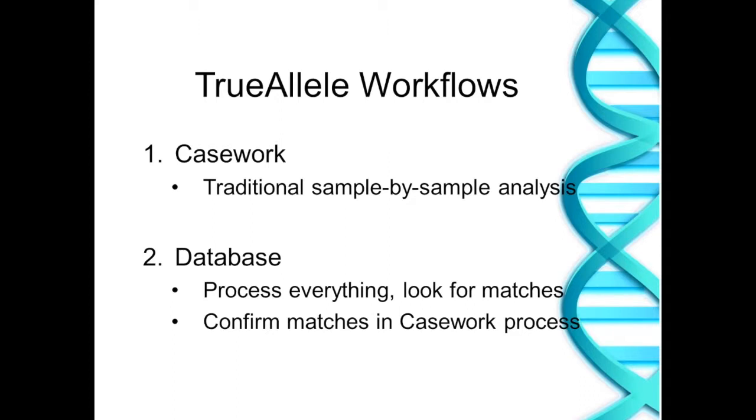The other workflow is the database workflow, in which you batch upload the entire run file, or the entire run folder, excuse me, to an individual database world. You look for matches, and then you go back and take any matching samples to the casework process for confirmation. In our lab, we decided to go ahead and implement the database workflow for 2 reasons.